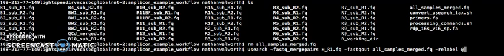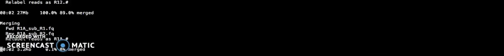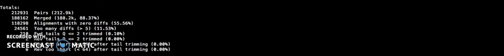So let us run the command, and this is the output usearch prints to the screen as it's running, and there we go, it's done, and it prints some summary statistics for us, which is needed in order to have some idea of what's going on with our sequences as we move along with the analysis.